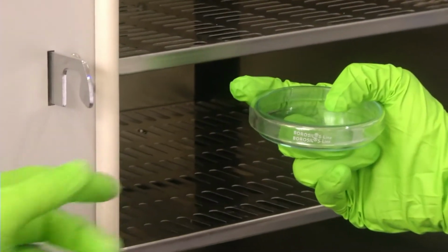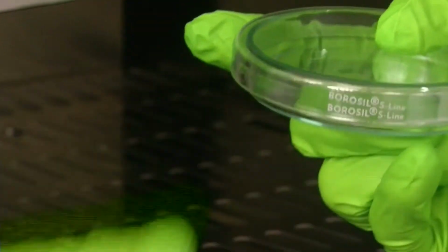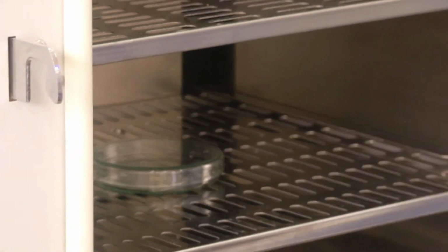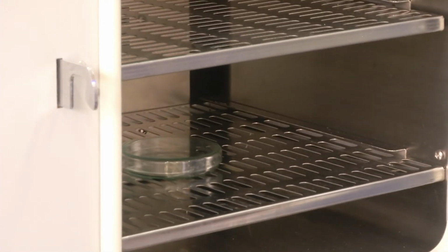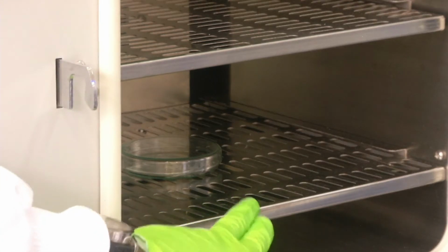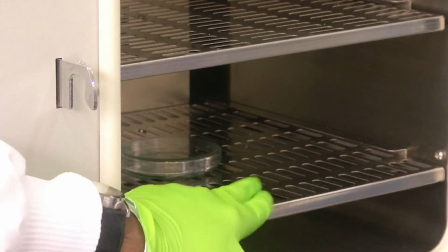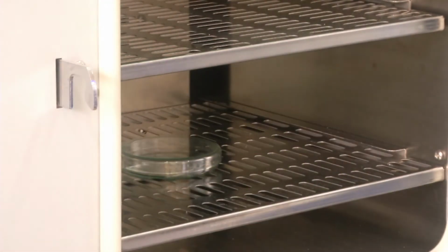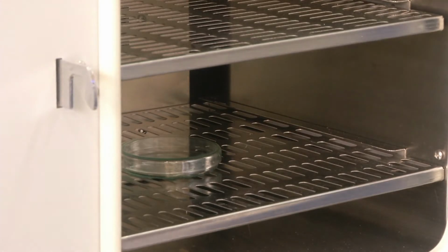That is a PDMS membrane that is kept inside, and it is put in a glass dish. Why are we using a glass dish? Because a glass dish can withstand very high temperatures, and your sample inside can be cured properly without affecting the container it is in. Suman has kept the sample sufficiently inside so that it gets soaked in the environment. Never try to keep the sample very close to the gate entrance of the oven. Keep it inside so that it gets properly soaked within the environment in the oven. Now he has kept the sample inside, now he will close it.